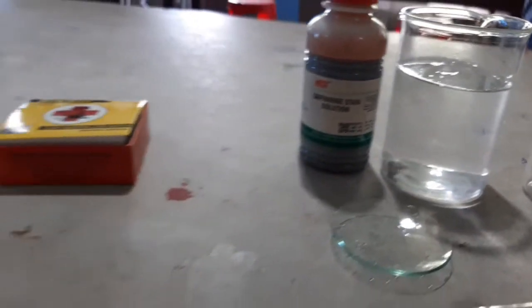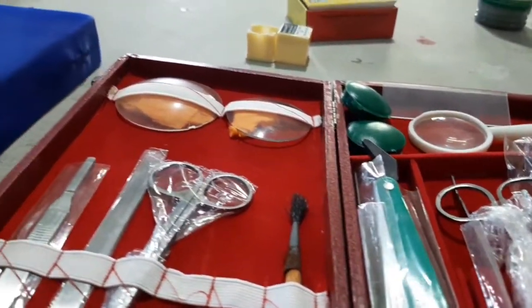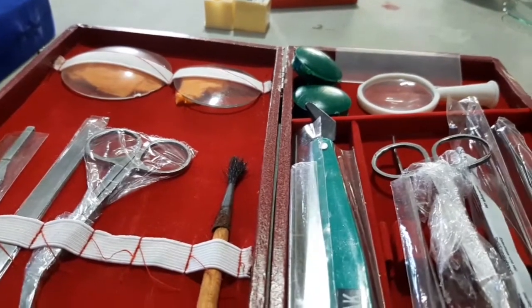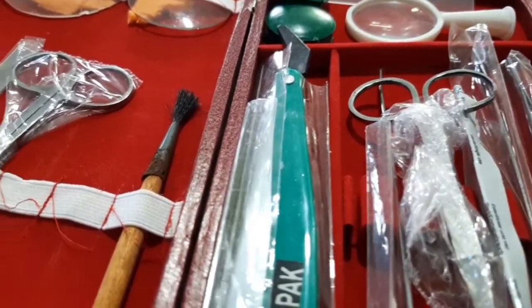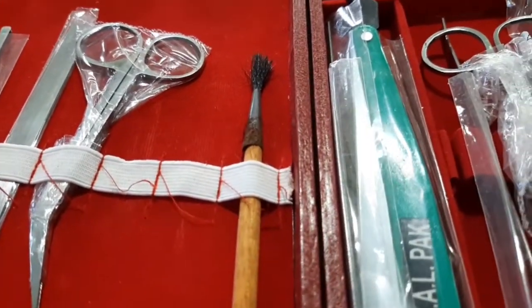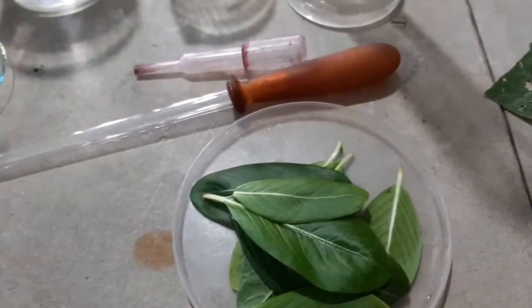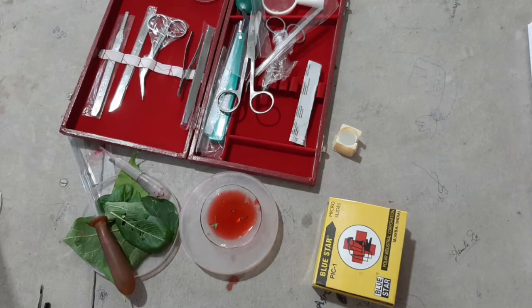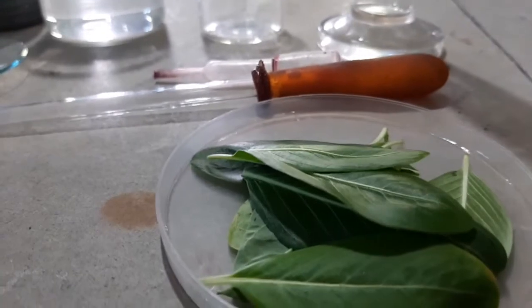And a dissection box. You don't need all the apparatus from the dissection box, you need only the forceps for bringing out the epidermal layer from the leaf surface and the brush. So let's perform the activity. At first, you select a freshly plucked leaf and then you take out or peel out the epidermis from this leaf with the help of a forcep.